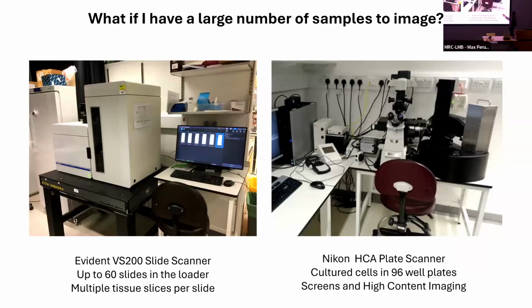This one is primarily for plate-based imaging. So we've got a robot that puts the plates onto the microscope, but typically you've got something like cultured cells, 96 well plates, for doing things like screens and high content imaging. So those are very handy things to have.